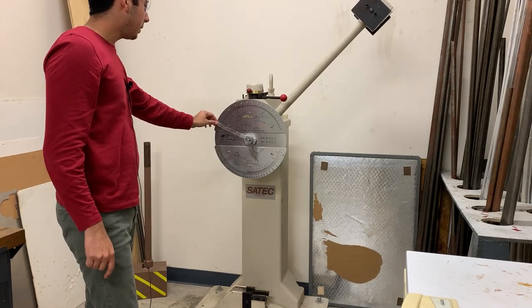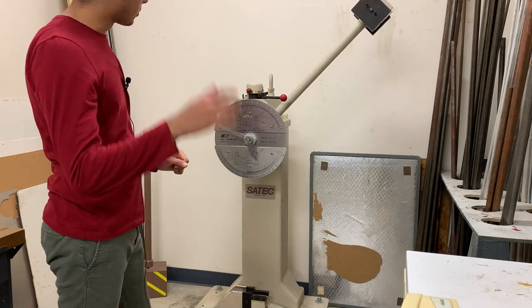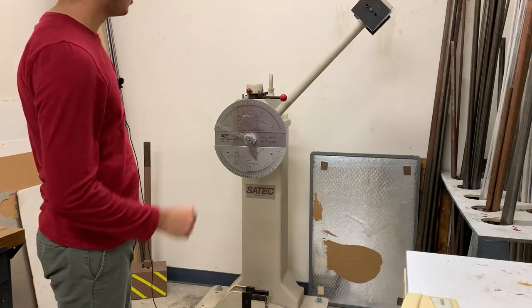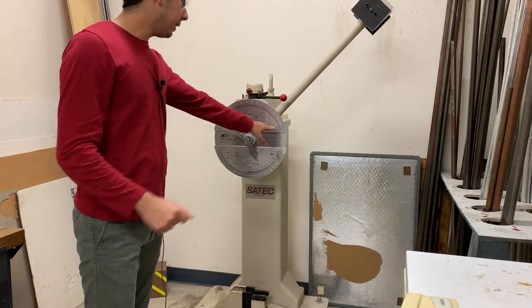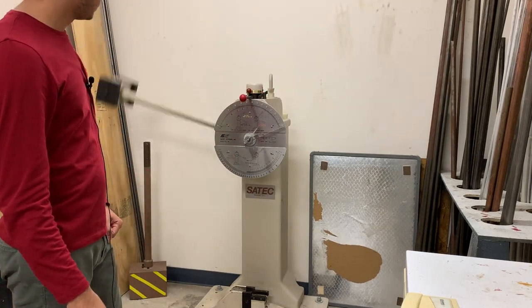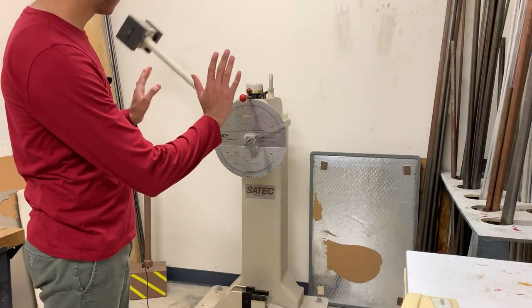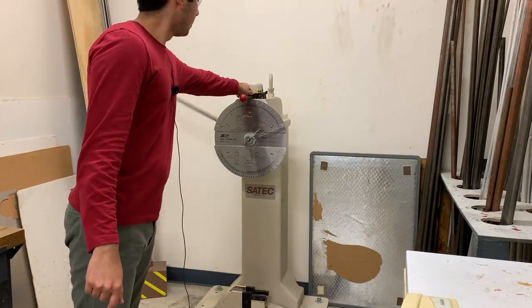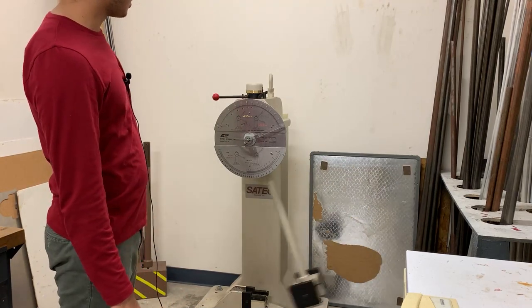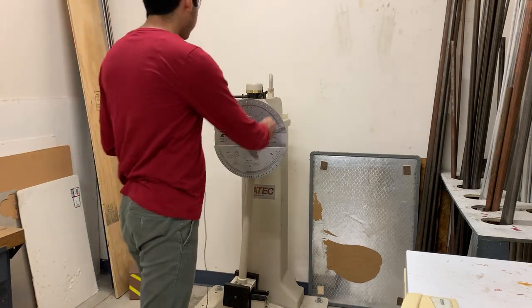I'm going to set the indicator to the left. When the arm swings it will go to the right. If I let it go right now you can see it will go back to zero because it's not breaking anything — that's how we know it's calibrated, because it takes zero foot-pounds to break nothing. I'll release the arm and you can see the needle went to the other side. The arm will keep swinging until we apply the brake, remove the pin, put it to the left, and it will stop.